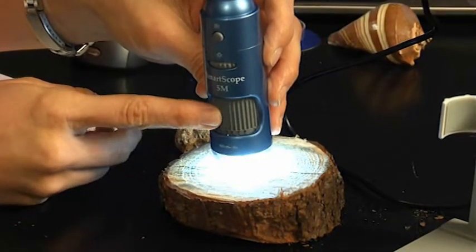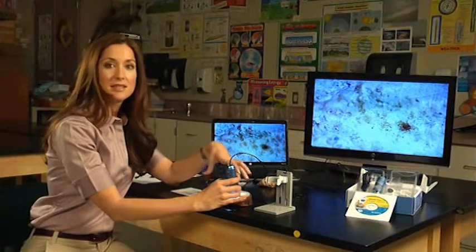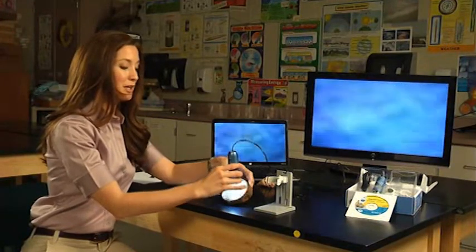And then I'll slowly turn the focus dial to the left. And you can see the wood is really coming into focus. You can move it around. Take a look at different aspects of the wood. But what's great about the SmartScope 5M is you're not limited to just this side like you are with the slide. You can actually pick up the object and turn it around and look inside there. You can actually see inside the crevices of the bark.